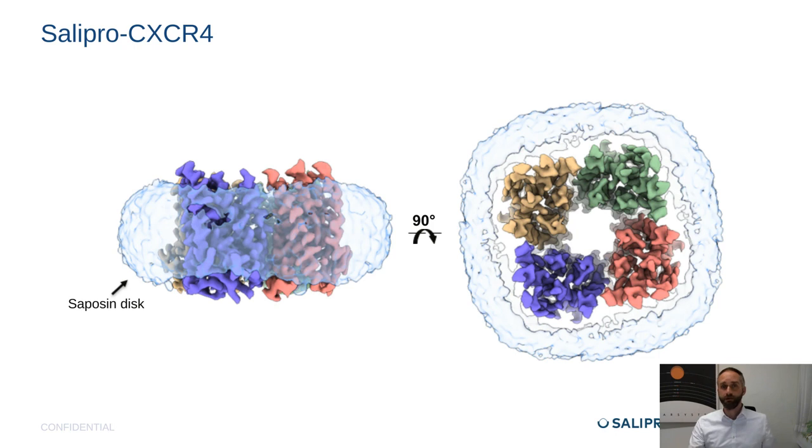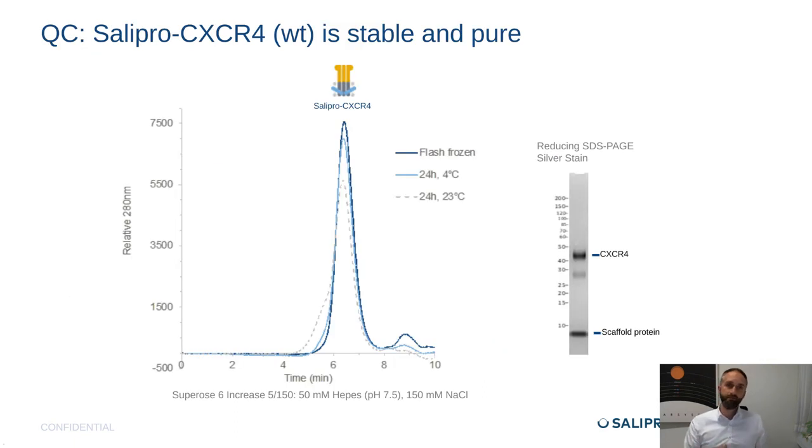So we have CXCR4 in a tetrameric form, as Ieva presented, and we already heard that it's straightforward to fit the AlphaFold prediction of CXCR4 into the density that we observe. Then we wanted to investigate: does the setup that we have, is it relevant?